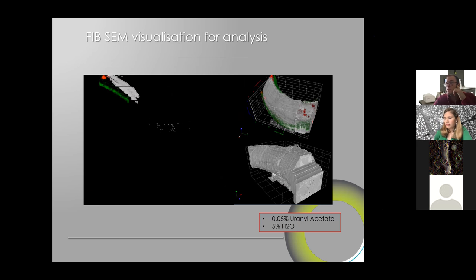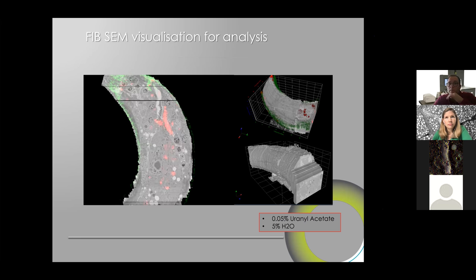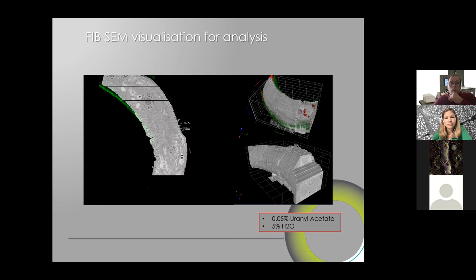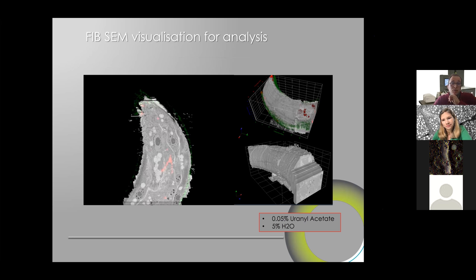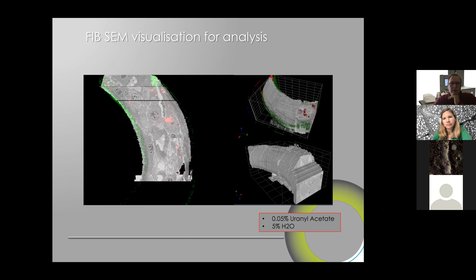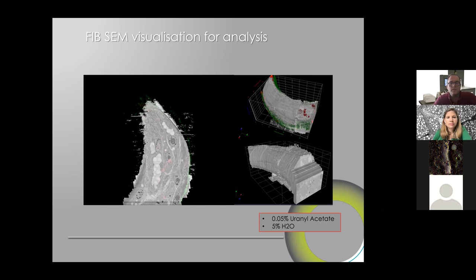And again, this was done with 0.05% of uranyl acetate and water in the freeze-substitution cocktail. So it's a very mild amount of UA, which is also one important point, because UA is becoming challenging everywhere. One of the steps we're about to start now is to test alternatives to UA to see whether we could use something else. Three to four weeks ago, Andrea mentioned ULS and UAR. We're also looking into lanthanide salts, and we'll try to see whether they have the same quality or not.